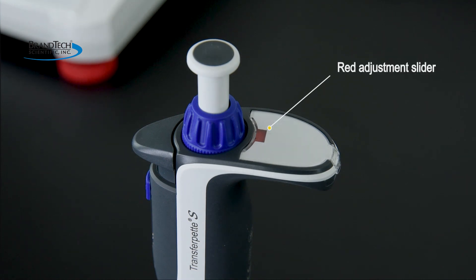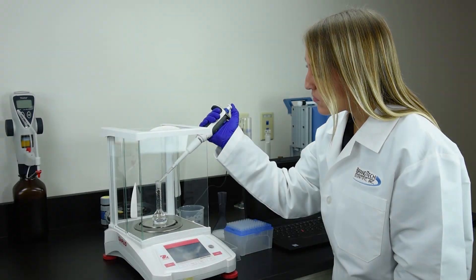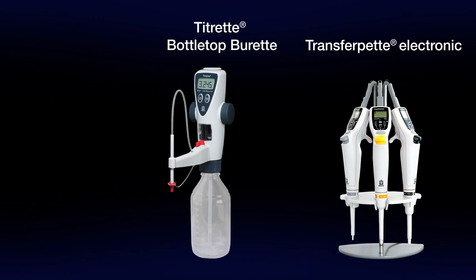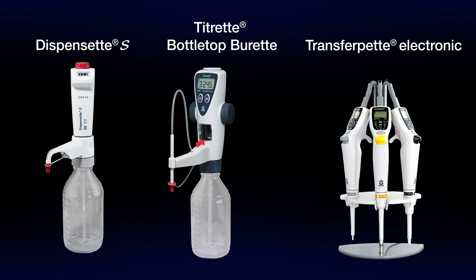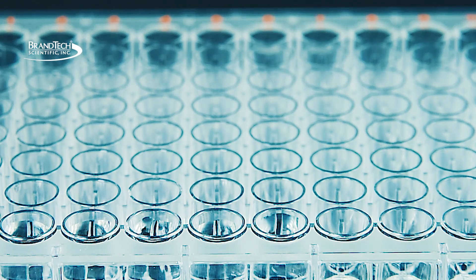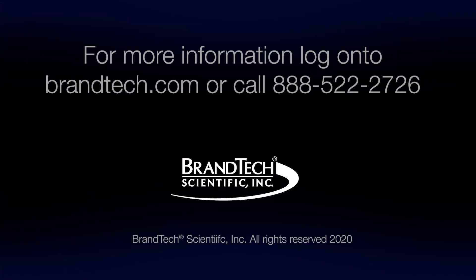The volume should be checked after each adjustment. The easy calibration feature is also available for the Brand transfer pet electronic, the Titrette bottle top burette, and the Dispensette bottle top dispenser. Brand makes precise laboratory work easier and more efficient. If you have additional questions and are located in the US or Canada, contact Brandtech Scientific customer service. For those from other regions, contact your local Brand representative.